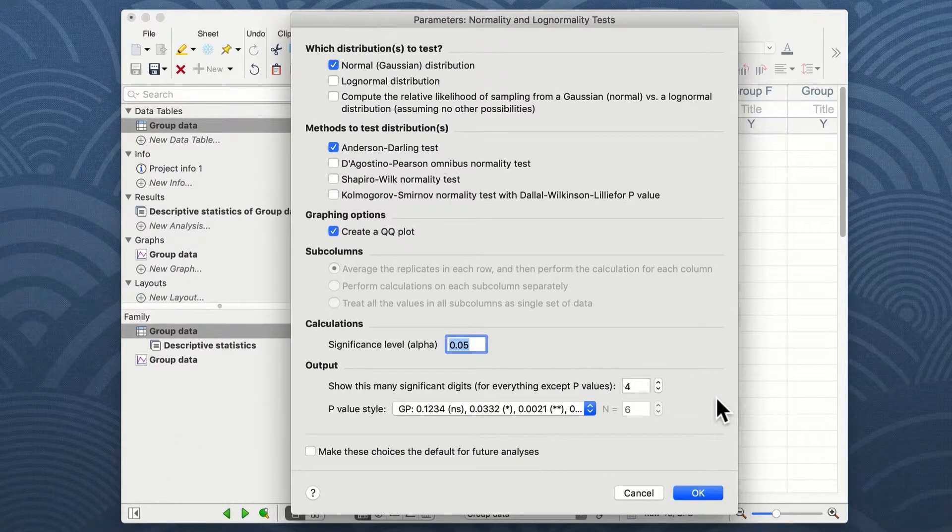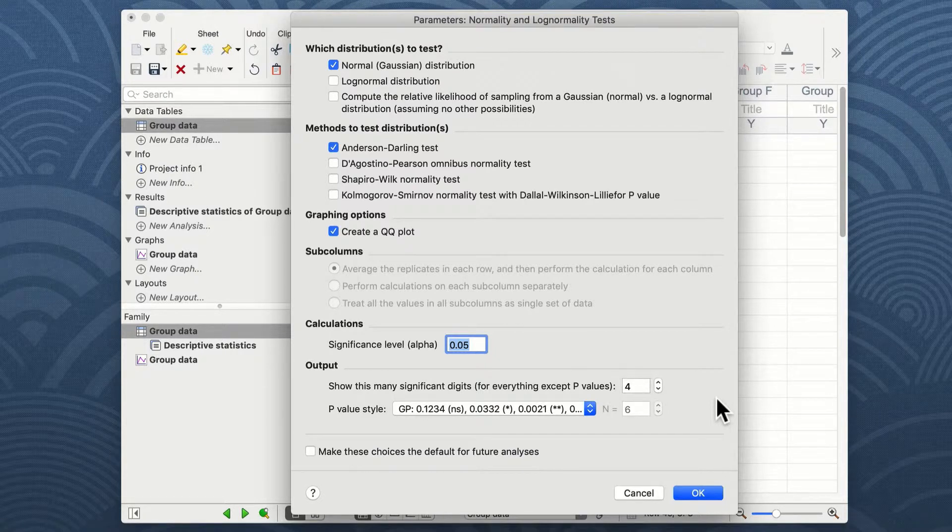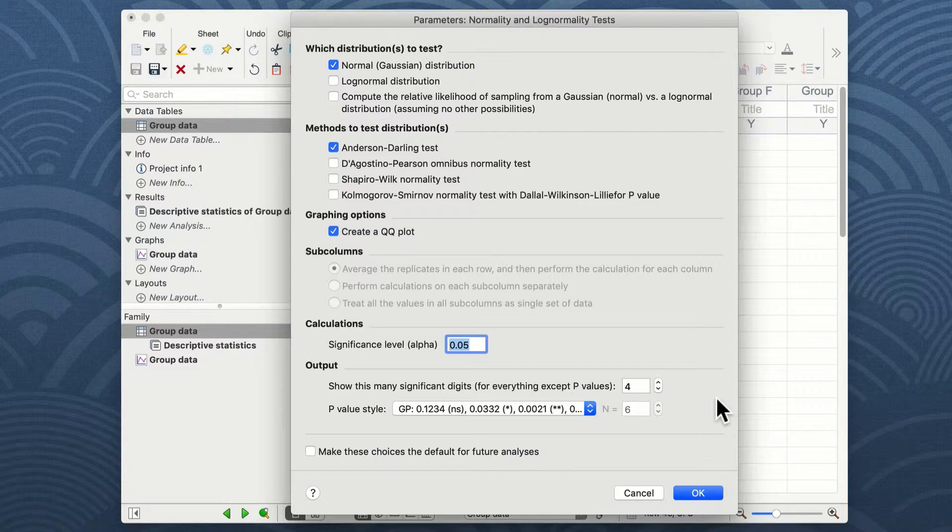The next window is the parameters window in order to carry out normality tests. In this example, I'm going to carry out a normal or Gaussian bell-shaped curve distribution test, but I could also choose a lognormal distribution.